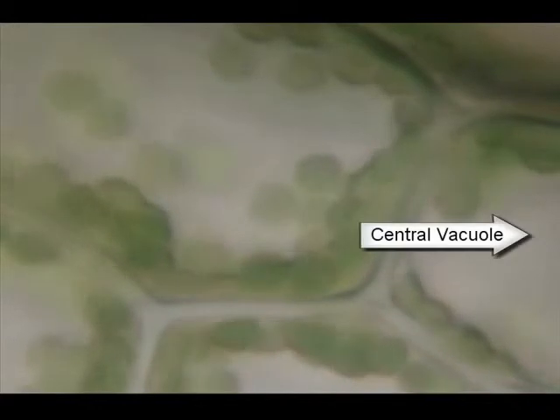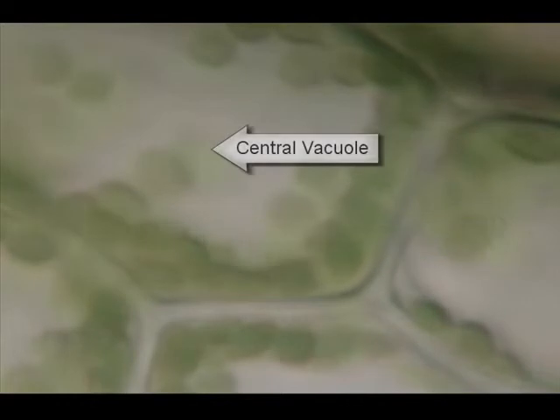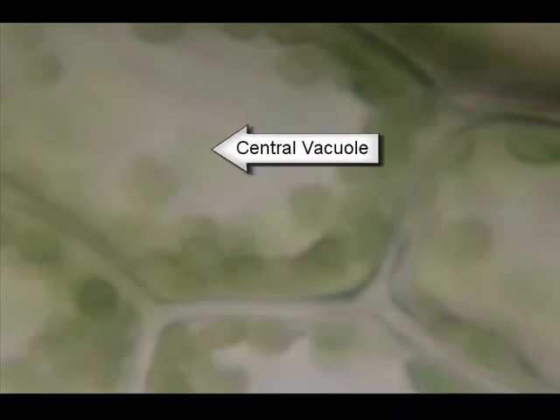Now imagine taking a balloon and inflating it inside of a box. If something were to move within the box, it would have to push its way between the box and the balloon. The chloroplasts are pushing their way past the vacuole and being held against the cell membrane and cell wall.